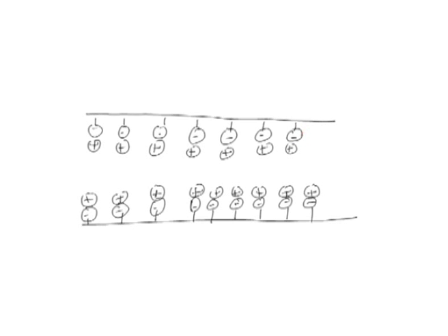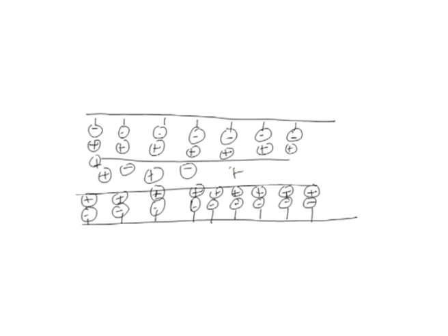On both sides you have positively charged ions from the electrolyte or from the solution moving towards negatively charged particles. Then there are other positively and negatively charged ions in between here.